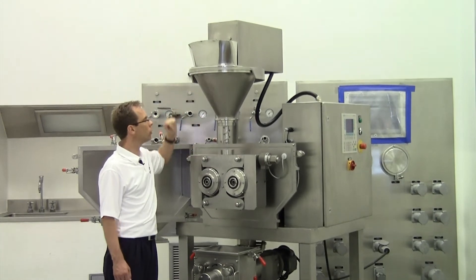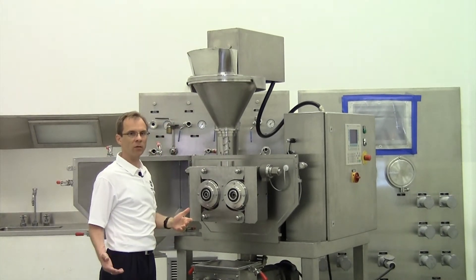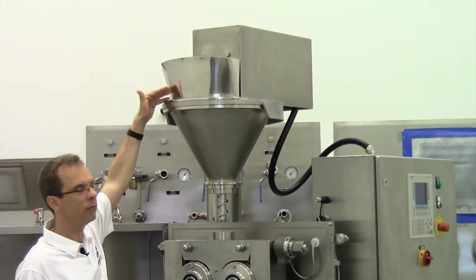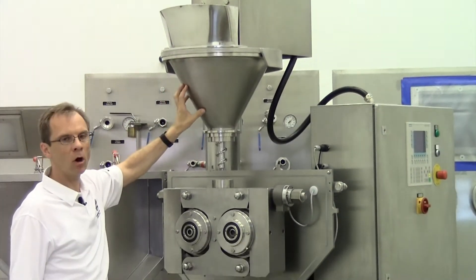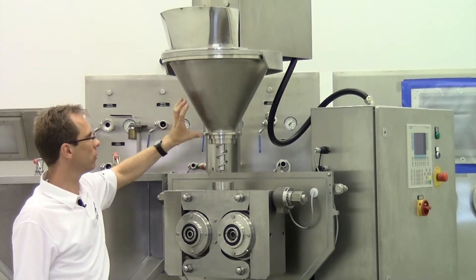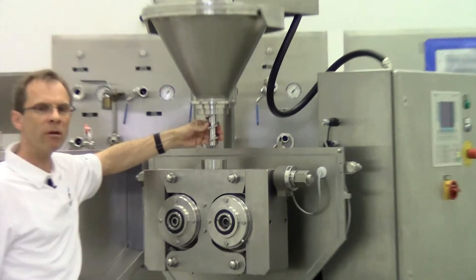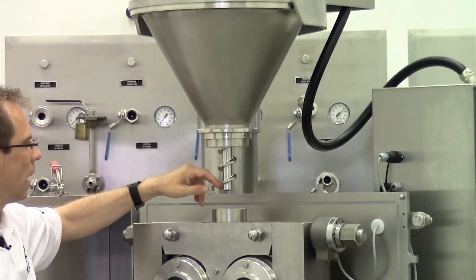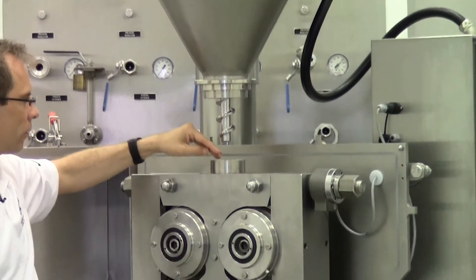I'd like to show you the Pharma Pactor and its interiors. We start here at the top with the infeed chute — it's a manual infeed chute with a conical hopper for the material, where you fill the powder. Here we have the screw auger with a stirrer inside and also the screw chamber.